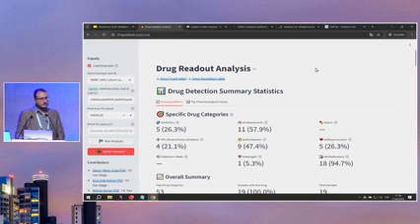I got some information from what you have said, but my point was, which platform do we use? For instance, if I go in the lab, I run maybe urine samples. I know that in urine samples there are so many metabolites and also drugs. How do I process that data to use this GNPS2? That's what I want to know. I want to see how useful it is to my workflow. Is it doable in that case?